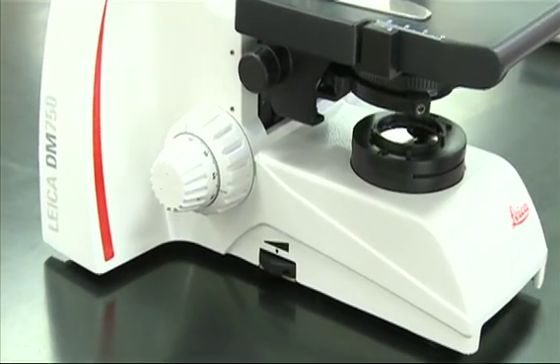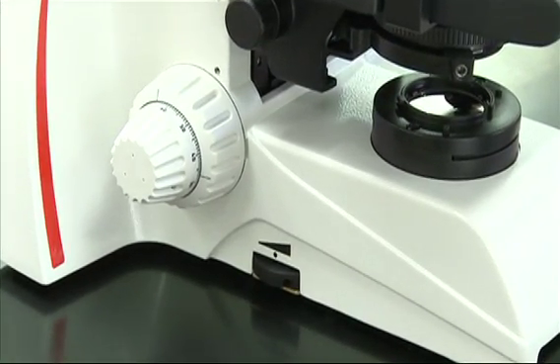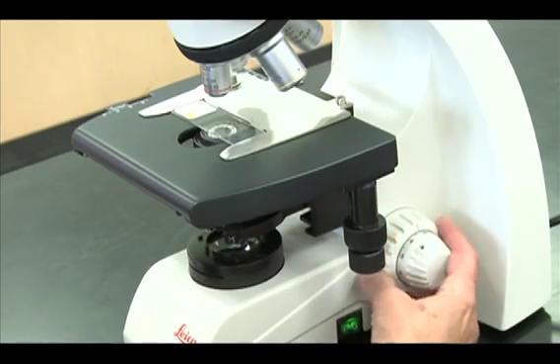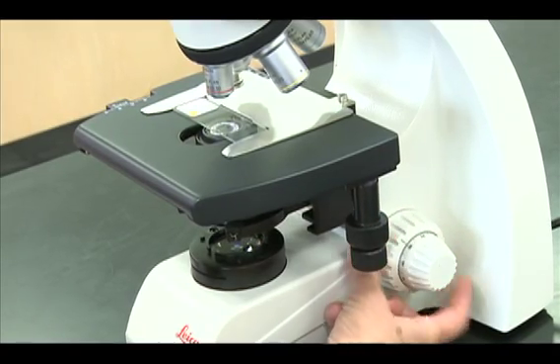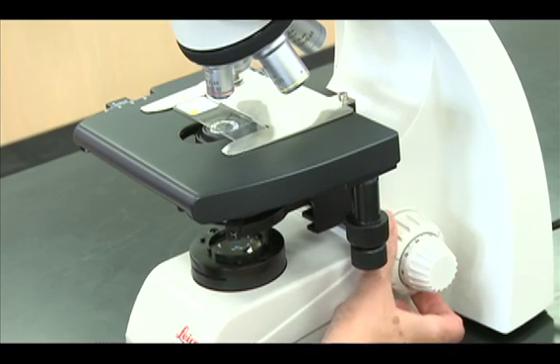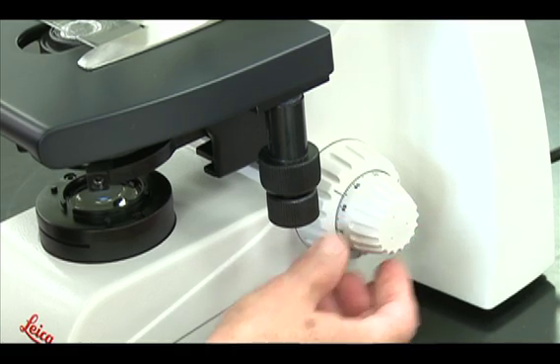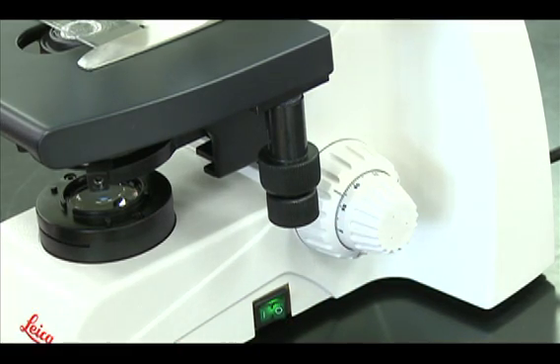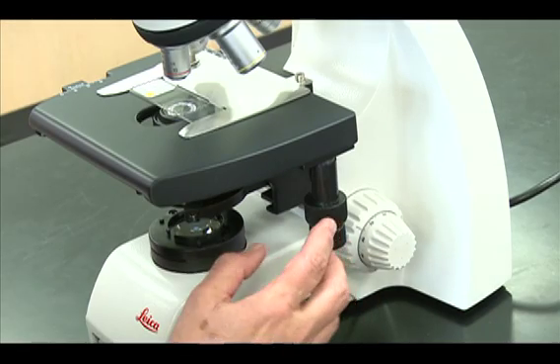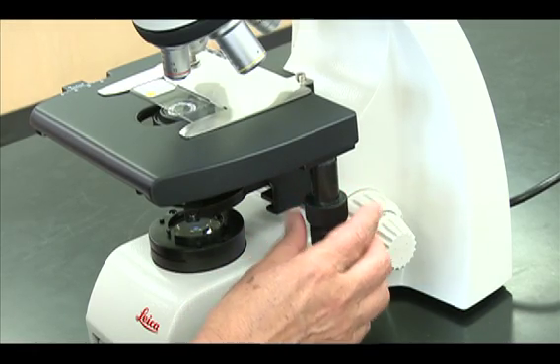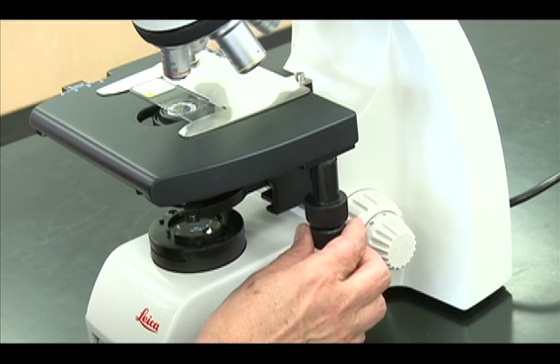Use the rheostat to increase the light to a comfortable viewing level. Use the course adjustment knob to raise the stage all the way up. Use the fine adjustment knob to lower the stage until the slide is in focus. Use the mechanical stage controls to scan your slide.